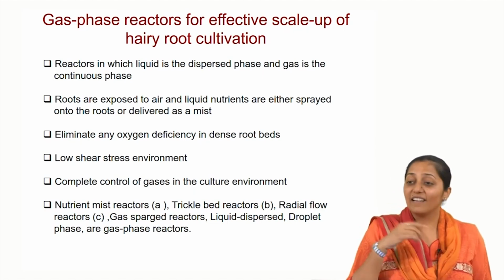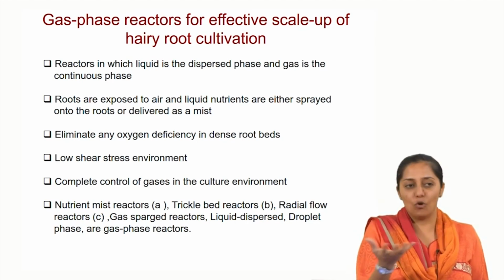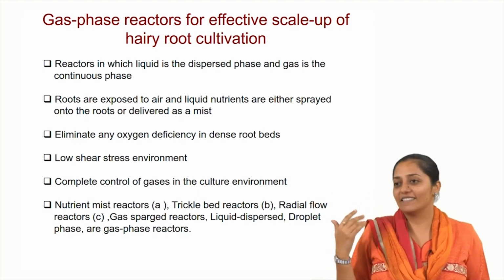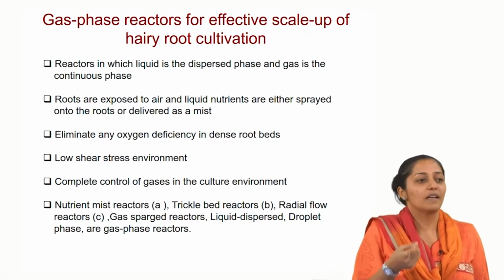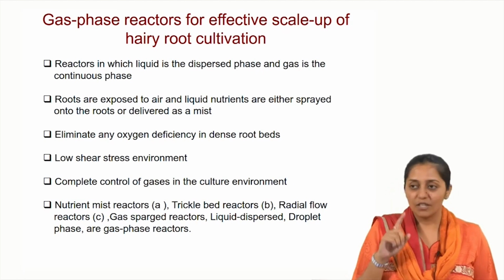We then changed the support also. Initially the support did not have any holes, then we created holes onto the support so that the water could drain down and go back to the reservoir. But that also did not help a lot because we could still see a lot of water retention onto the roots, and then the mist design came up, which worked. But then scale up is an issue there.